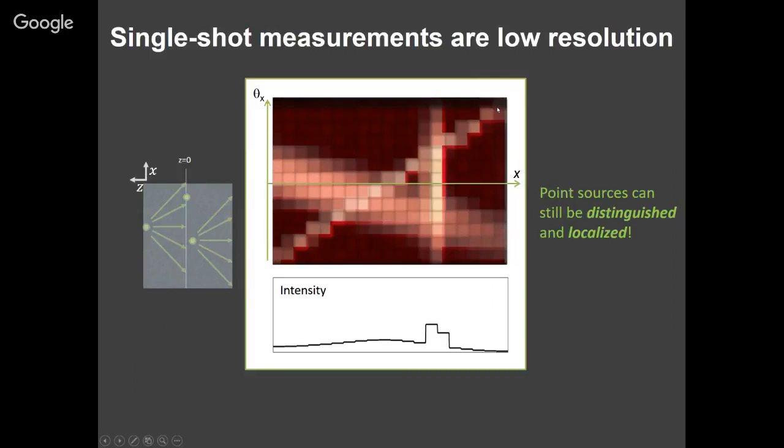And in fact, you can fit the 3D localization of this line. So you can find the slope of this line and its x-intercept with much better precision than the lenslet array size or the pixel size here, which is great because you're doing super localization for things that are off focus. So things in focus, you can only localize to within the size of the lenslet, but nothing's in focus if you have a lensless system here. So we only want to distinguish and localize.